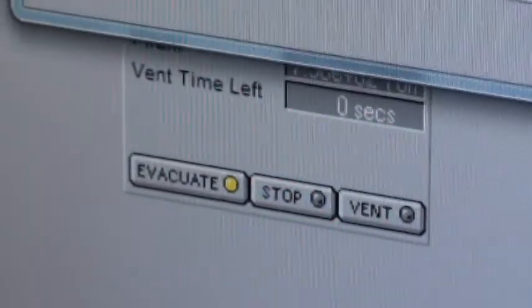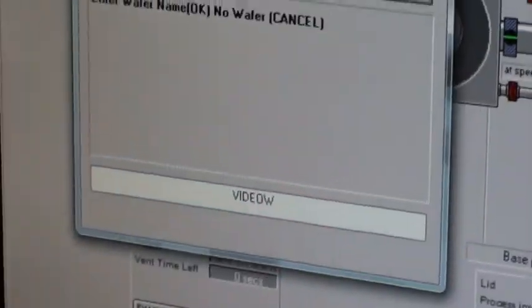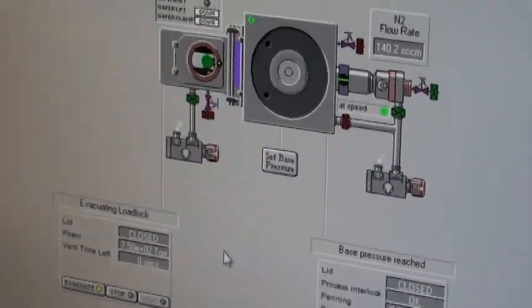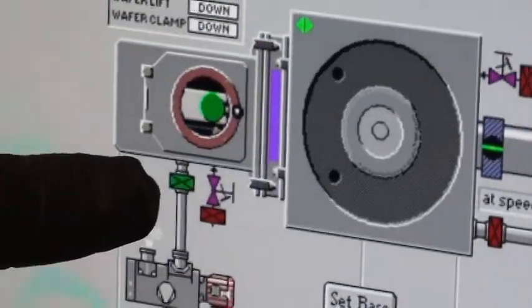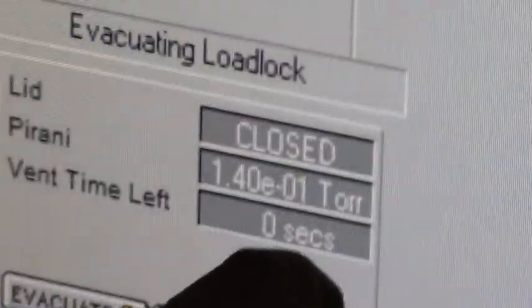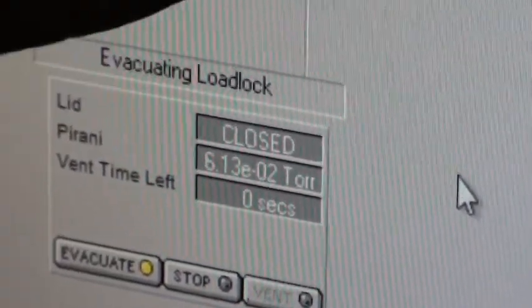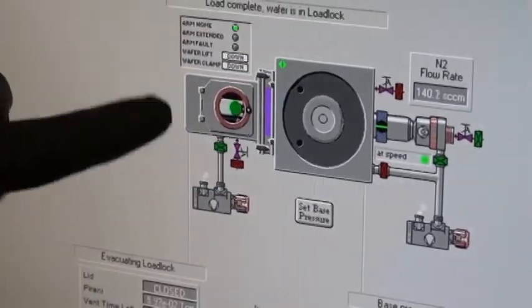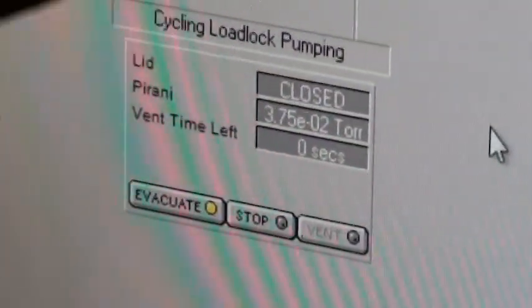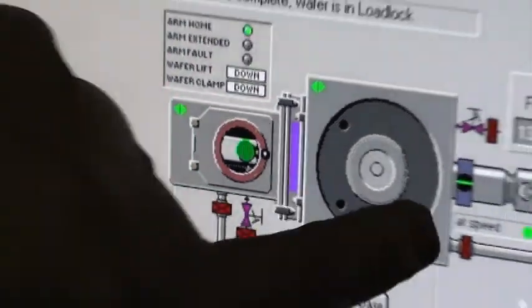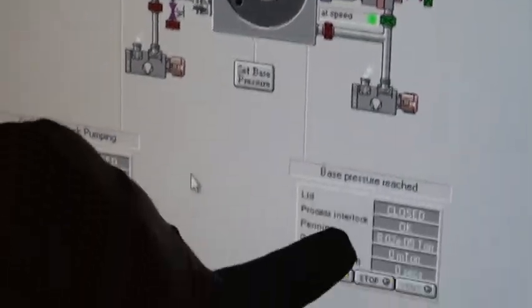So now if it was vent I would say stop. Evacuate. We'll call this video wafer. Video W. Okay I told it evacuate after I named the wafer. And that is for data logging. So now it's opened the rough valve. You can see from the Pirani gauge we are pumping down. When it is in a safe condition for wafer transfer you will see green on the upper left of this chamber. There. Now you see the green. That means it's safe for wafer transfer between the two units. As you can see the chamber is already at a high vacuum state. 8 to the negative 5 Torr.